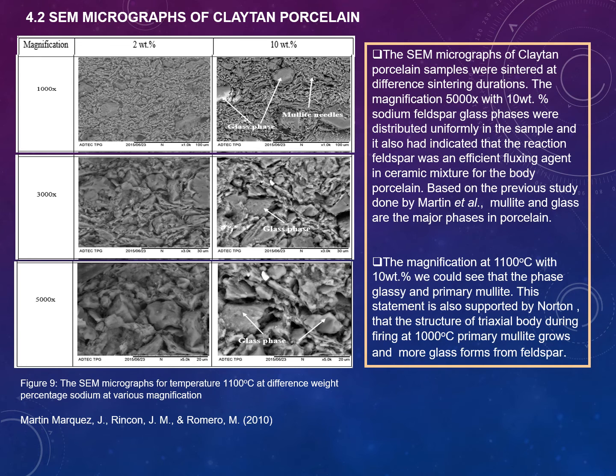This is the SEM micrograph of CLAYTAN porcelain. The SEM micrographs of the CLAYTAN porcelain samples were sintered at different sintering durations.